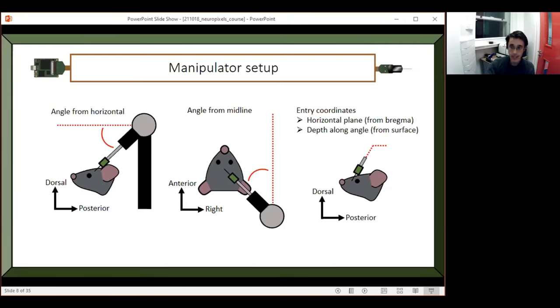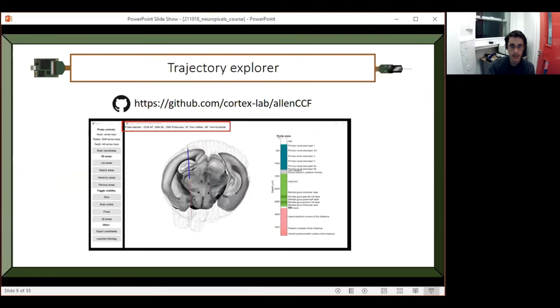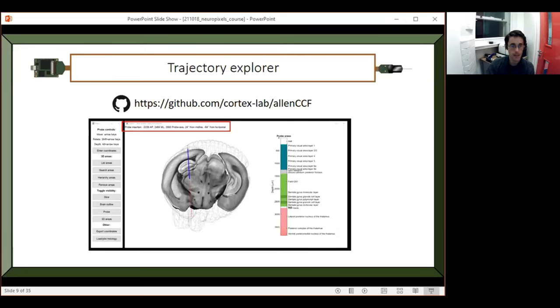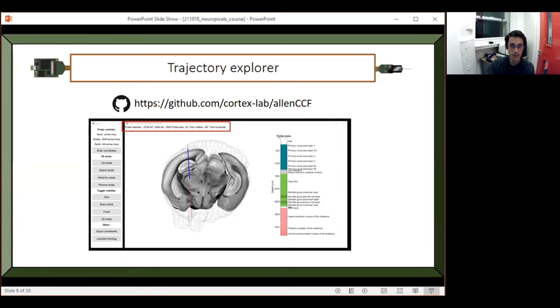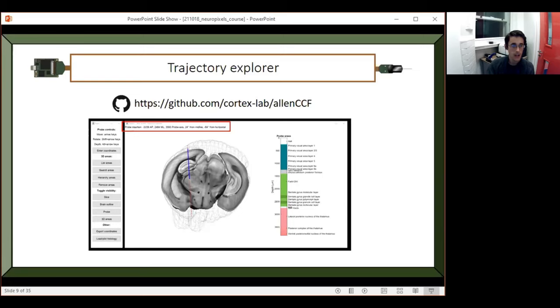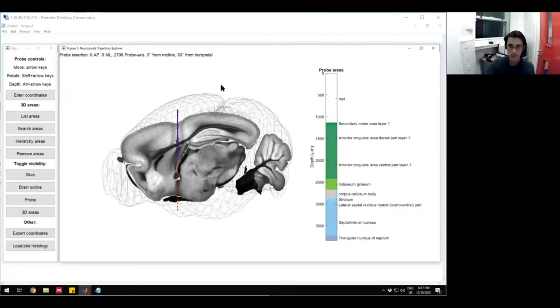Getting these coordinates, I do with this trajectory explorer that I wrote. It's a MATLAB package, but it is installable if you don't have MATLAB. These instructions should be available on the handout. There's going to be homework associated with this. If you have questions, feel free to ask at any point on the Slack channel. If there's bugs or anything in the future, you can always raise issues on the GitHub as well.